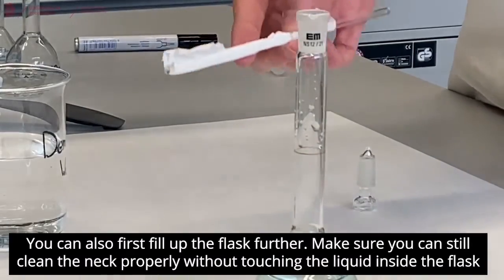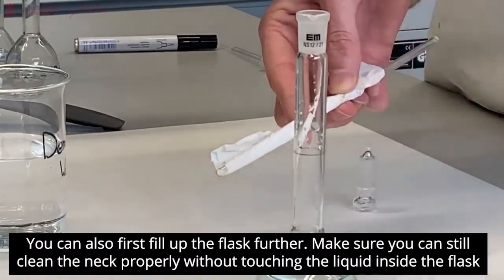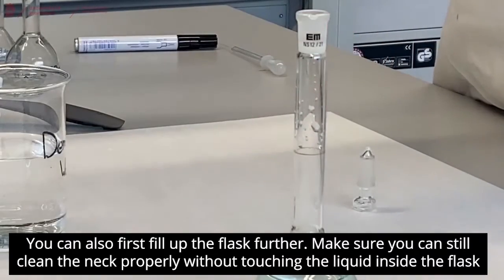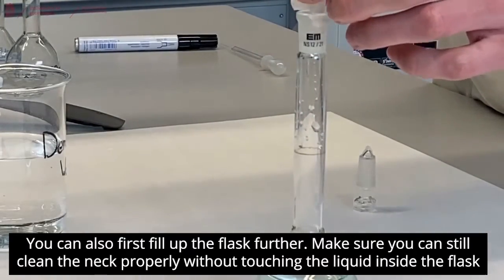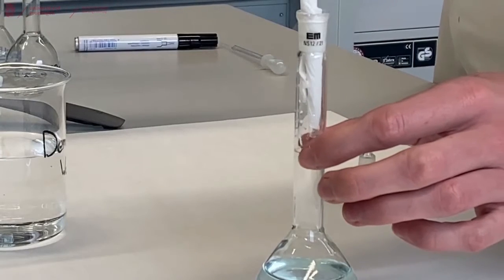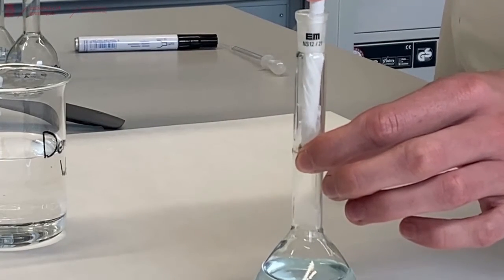To do that, we can use a glass rod with a piece of tissue paper, or you can use a spatula, and then you carefully dip it into the volumetric flask and soak up all the liquid that's on the top part of the volumetric flask.